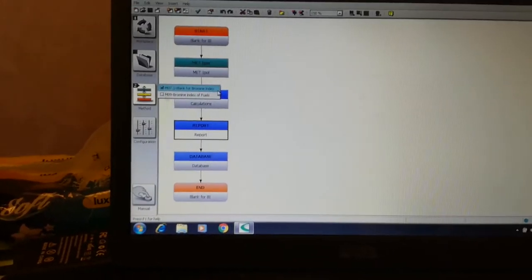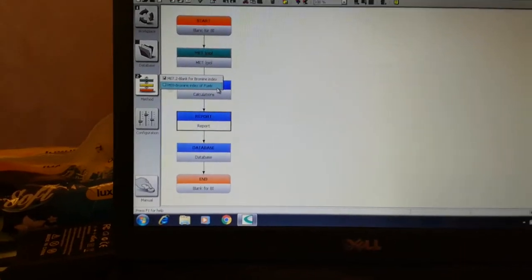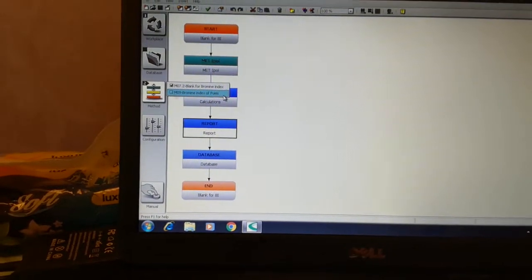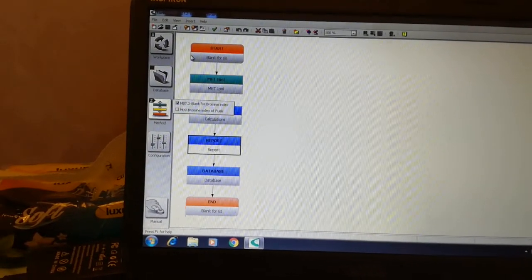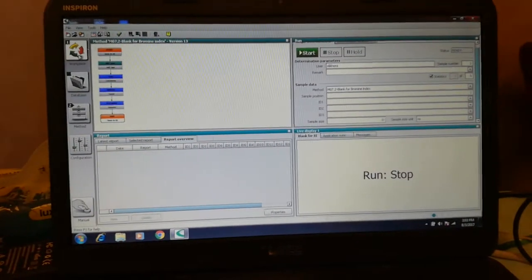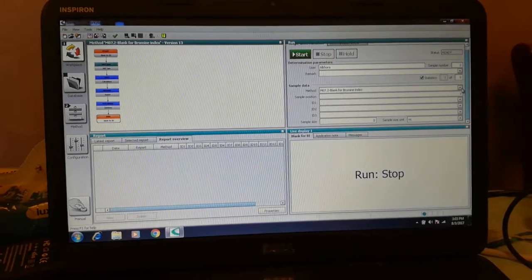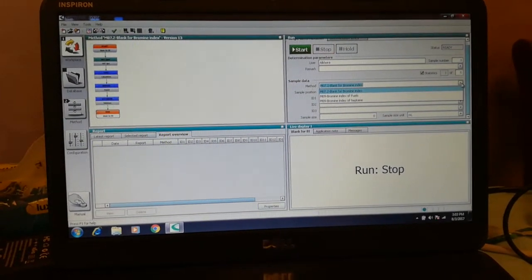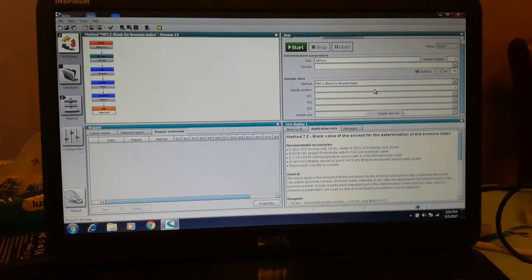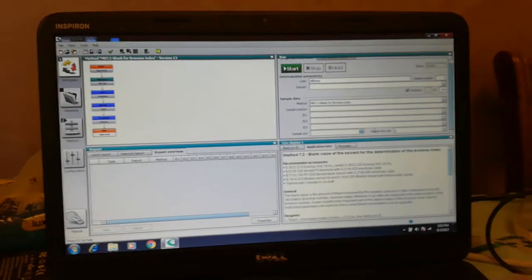Once we set up the methods, we have here two methods: the first one is 'Blank for Bromine Index' and the second one is 'Bromine Index in Fuel Products.' Save them, then go back to the workplace, and here you have to choose the right method.